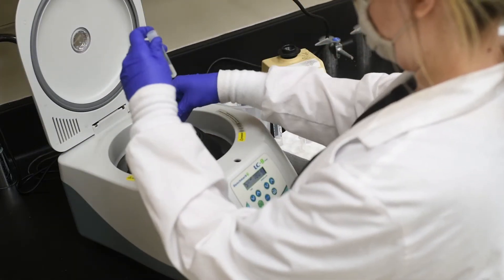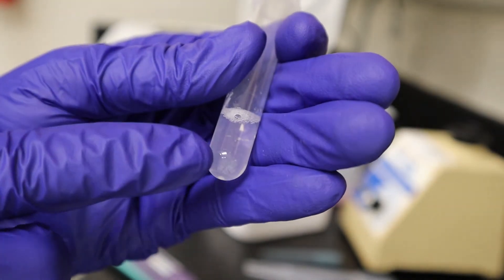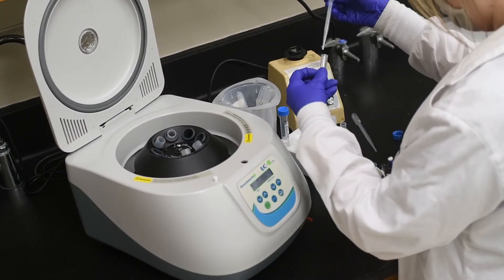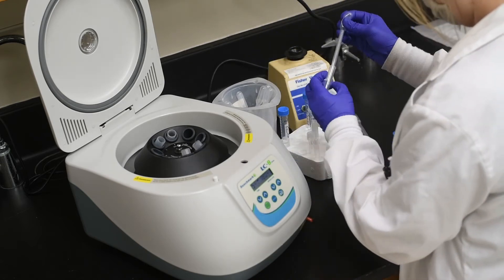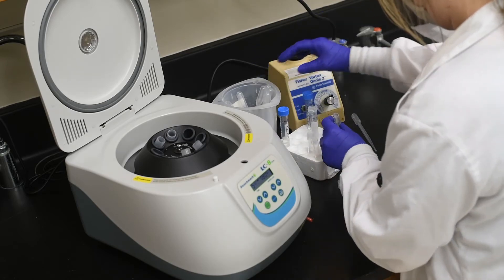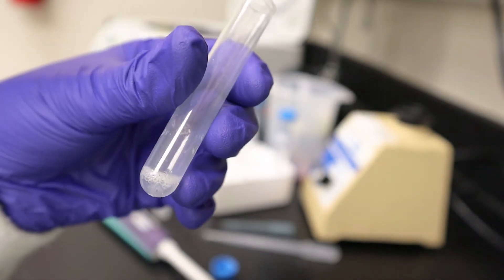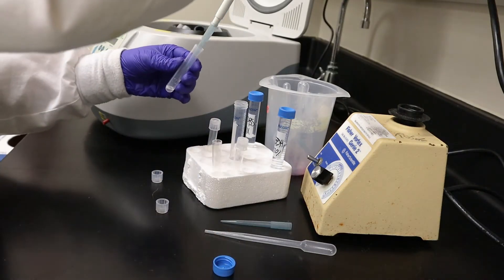Once centrifugation was complete, all but 50 microliters of the PBS were removed without disturbing the pellet. With the remaining PBS, the cells were resuspended and added dropwise into a fresh tube containing 1 milliliter of ice-cold 70% ethanol.